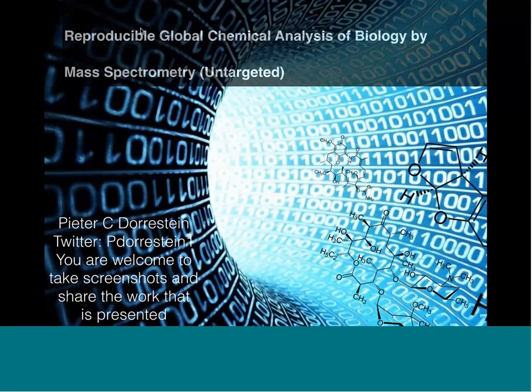And so the way the annotations help is that even though we don't have a molecular annotation, we at least have an annotation of where these molecules might be coming from. Then to provide annotations, we rely on the community. So as I highlighted throughout the talk of the strategies, which is the way we capture community knowledge. Also propagation, using molecular networking, we can propagate one molecule to another, and we need to capture that information.